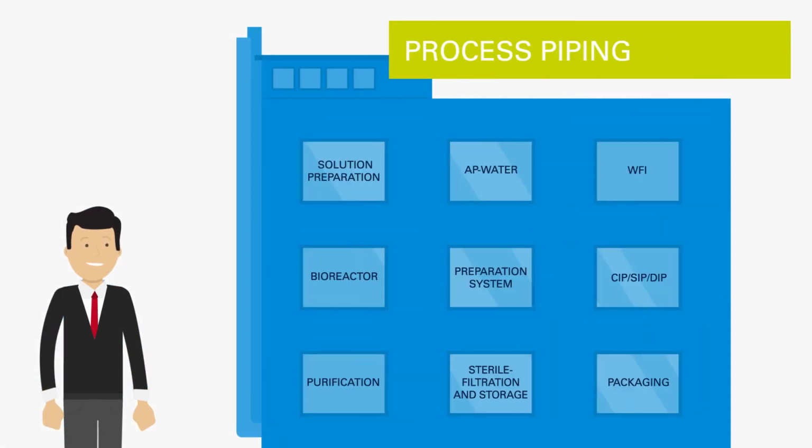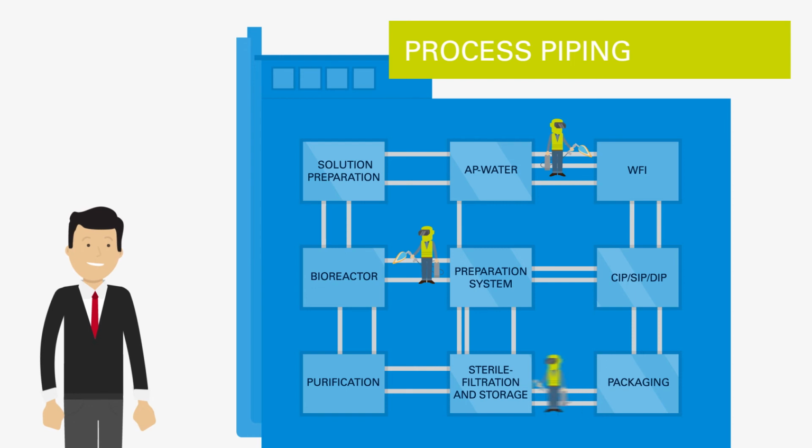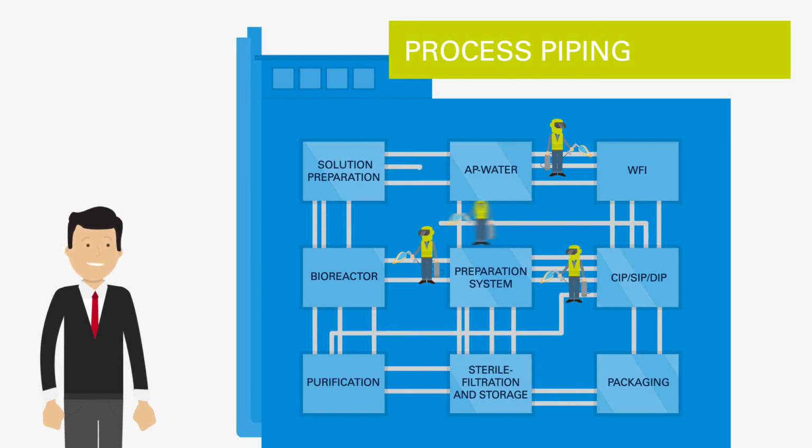One thing we have not as yet looked at, and unfortunately this is also true in many aspects of life, the process piping of such a system is at least as important as the individual processing facilities. And a complete production such as this has many pipes. Many pipes. Bilfinger perfectly coordinates these too, together with the other components of the plant.